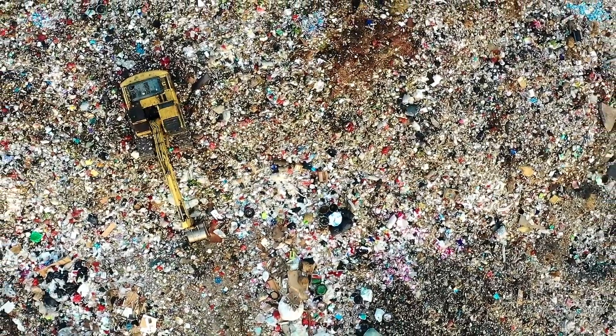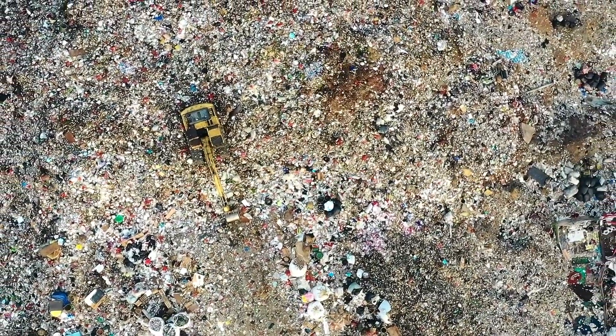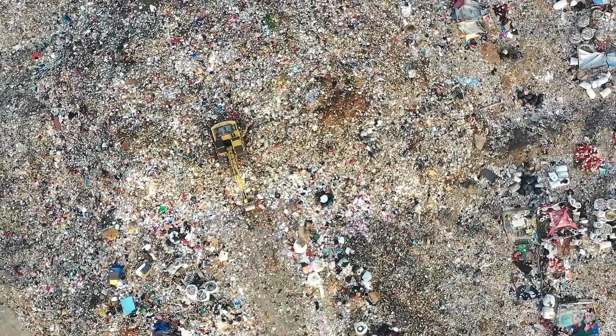So how do biodegradable disposable gloves work? It's actually breakthrough technology where a biopolymer is added to the glove itself so that when they end up in landfills, they can actually break down rather than staying in landfills or in oceans for hundreds of years as standard disposable gloves do.